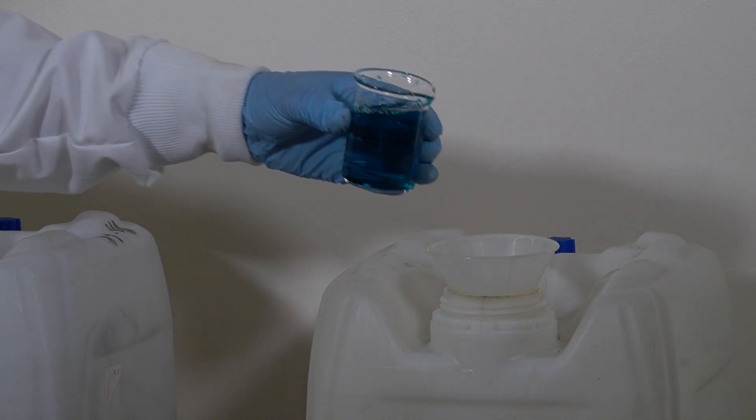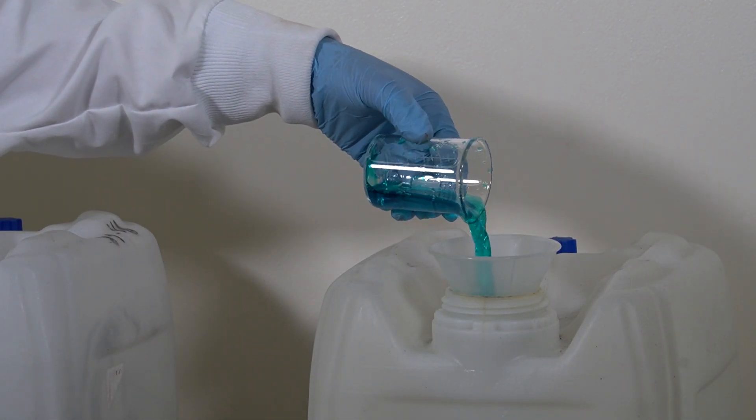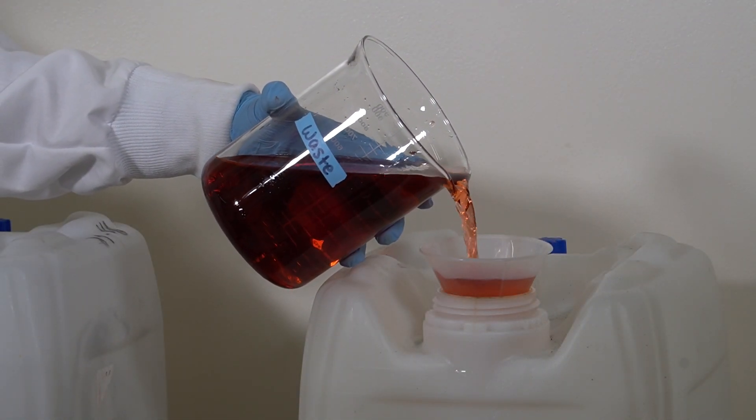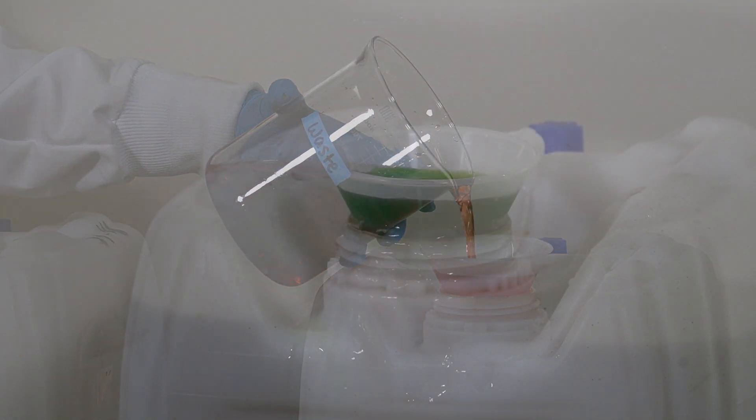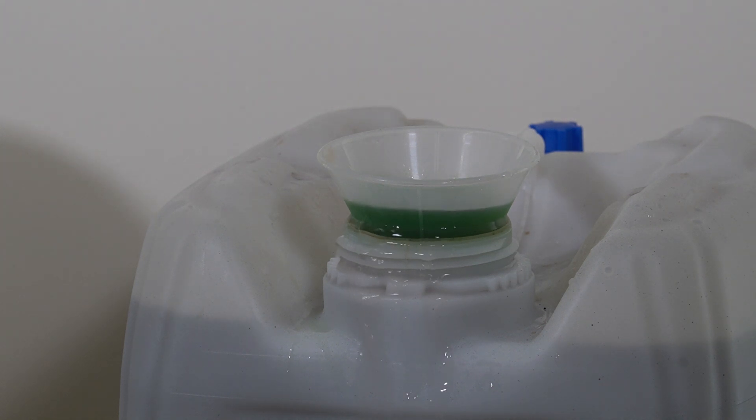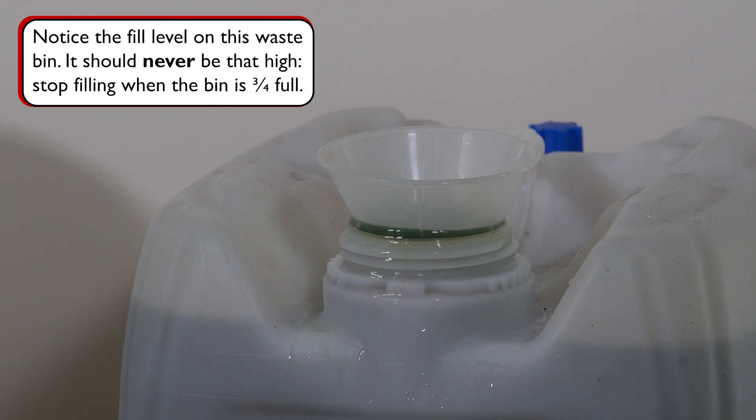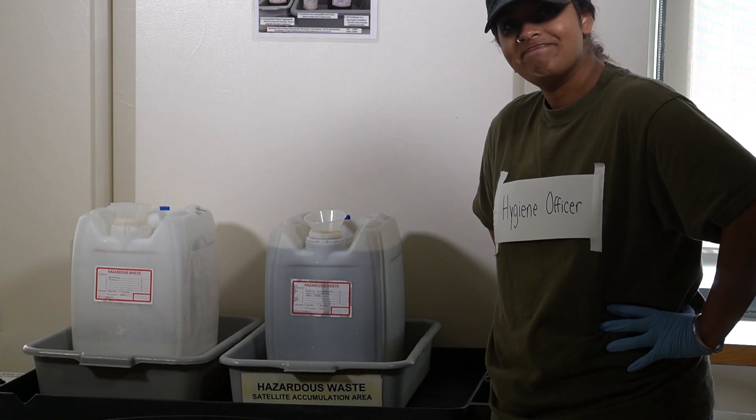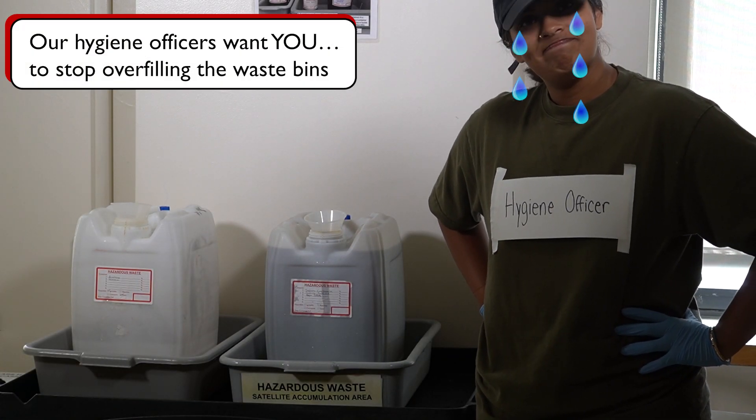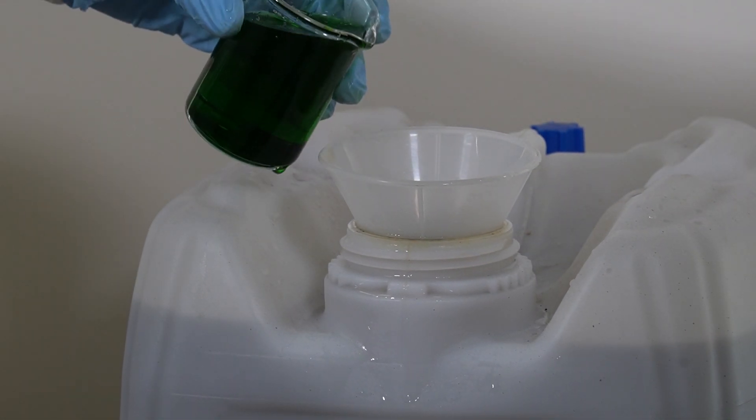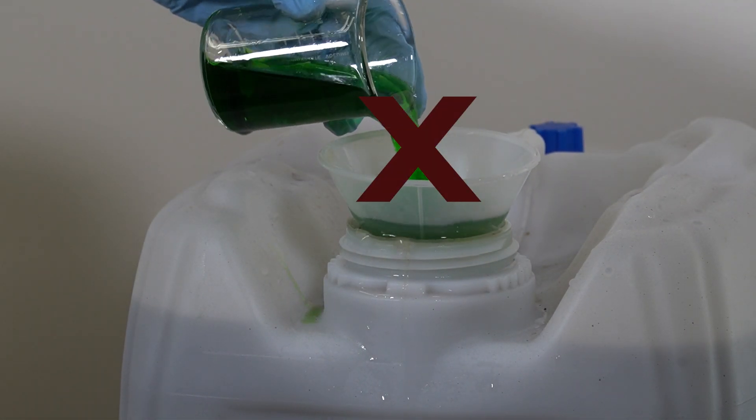In addition to monitoring the amount of waste you collect in a beaker, you should also pay attention to the level of waste in the large waste bin. Think about the chemical hygiene officers that will remove the waste for us after we are done with the experiment. If you overfill this large waste bin, it will make their job challenging and pose threats to their safety. Therefore, you should never add more to the waste bin if it is about three quarters full.